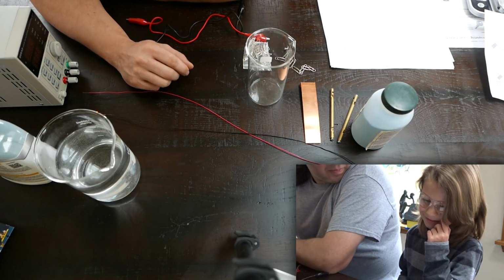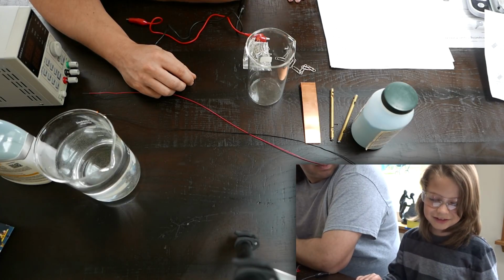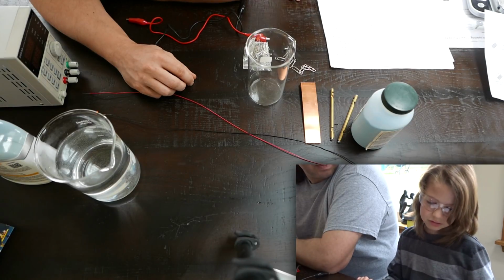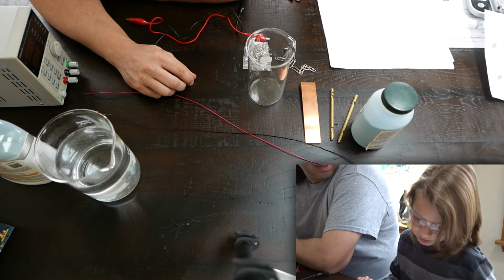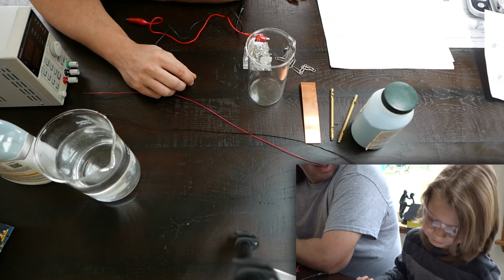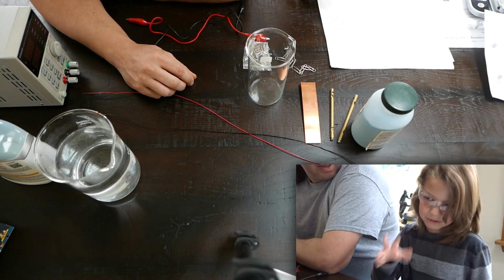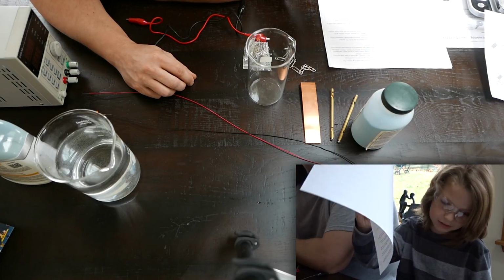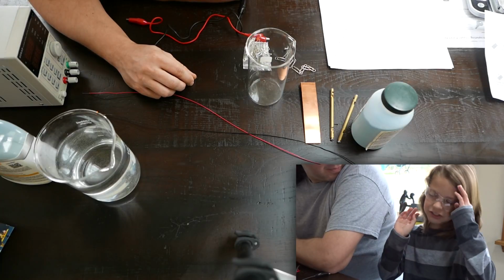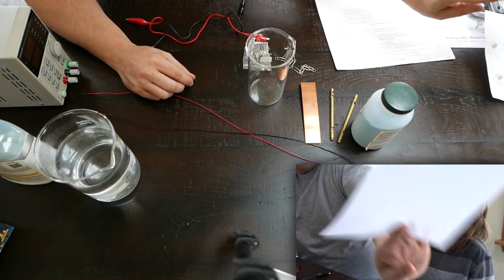No. However, the health, which is blue, is a number 2. Intense or continued, but not chronic exposure could cause temporary incapacitation and possible residual injury. Diethyl ether is an example, and ammonium phosphate. And then we're number 2, right? There's reactivity. We are number 2, right? Yes. So you got to take some precautions, right? Caution. It's not deadly.